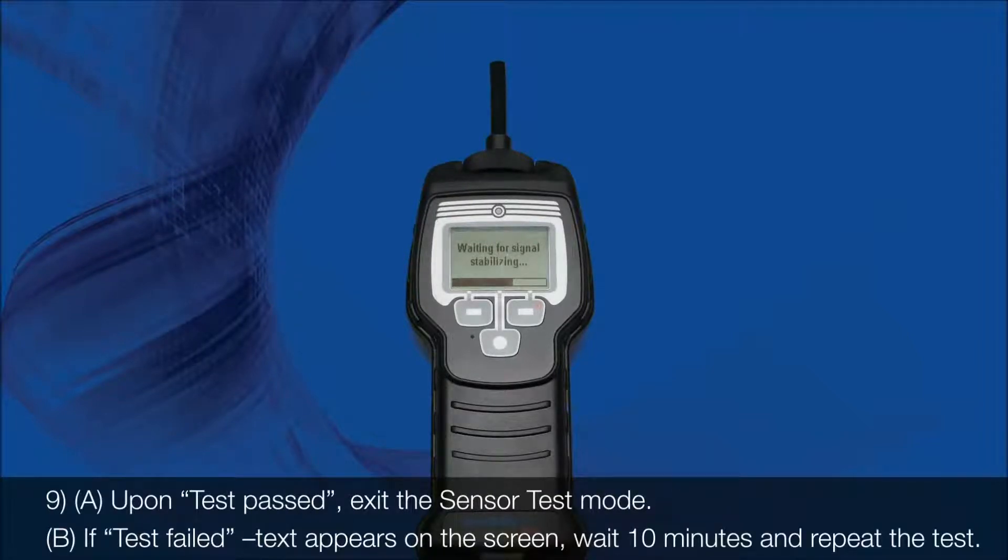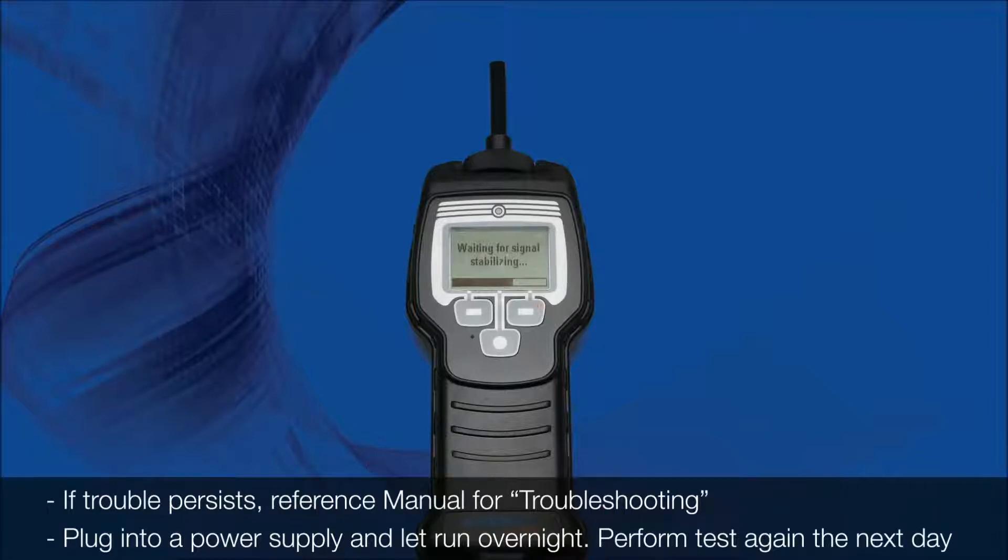9. Upon test passed, exit the sensor test mode. If test failed text appears on the screen, wait 10 minutes and repeat the test. If trouble persists, reference the manual for troubleshooting, plug into a power supply, and let run overnight.